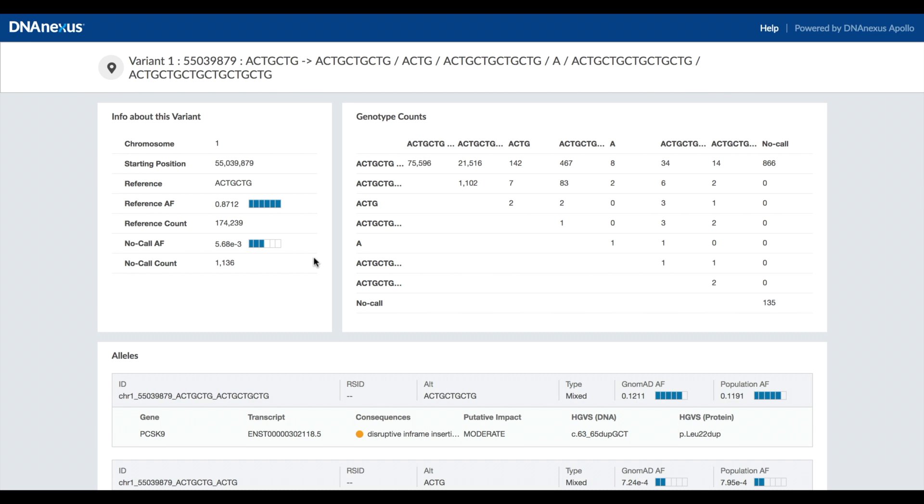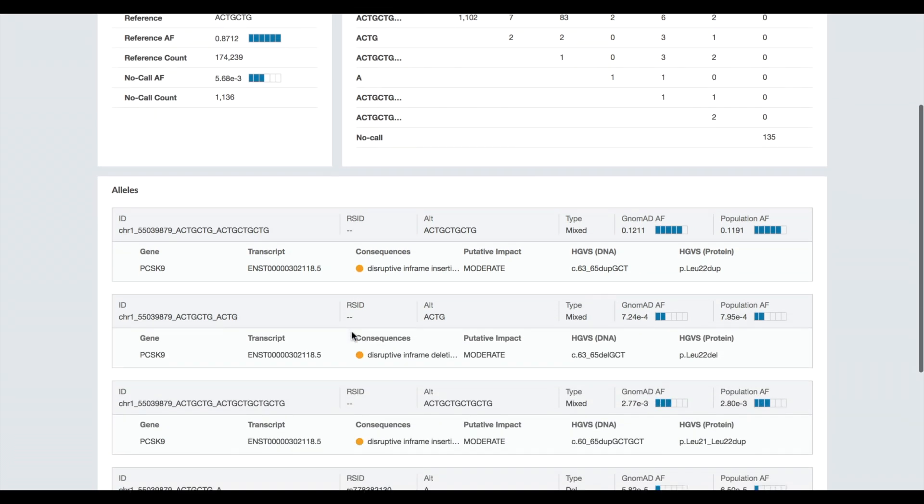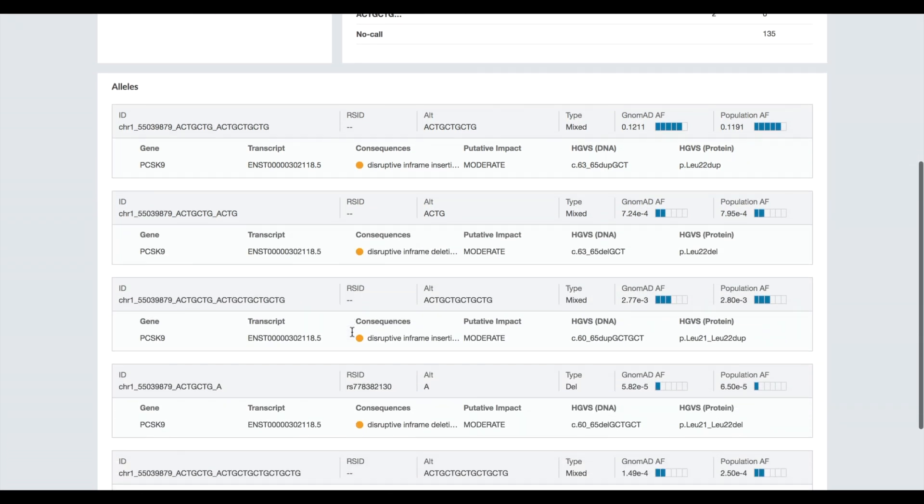This page aggregates the information for all of the alleles that are present at this locus. Then we see the counts for each possible pairing of the alleles at this locus in the full cohort. And finally detailed information about each transcript at this locus.